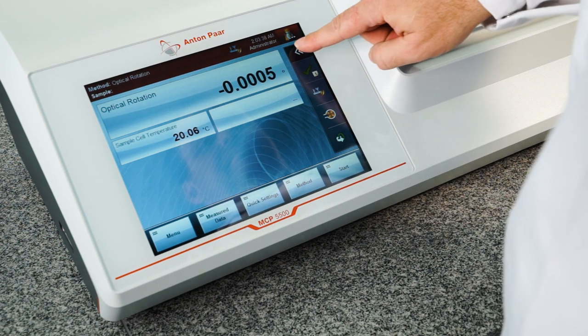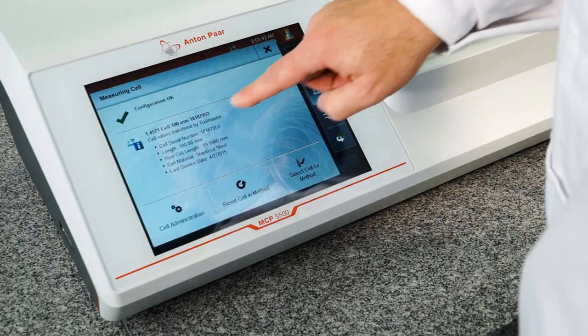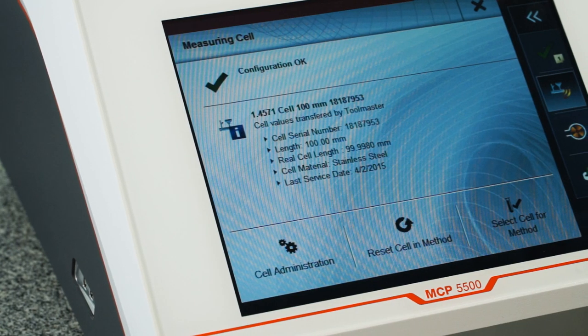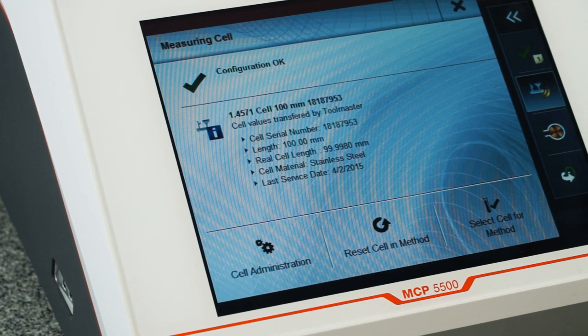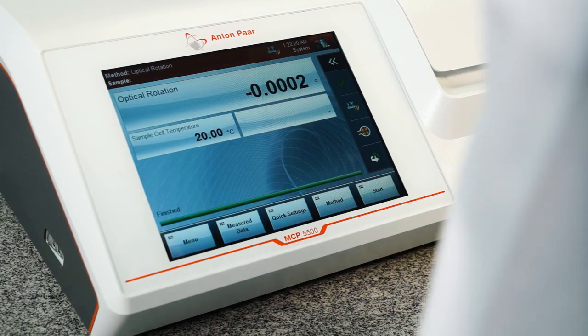The Toolmaster technology is also used for the Quartz standards. All relevant data concerning the optical rotation and the official reference values are stored on the RFID chip and transferred automatically to the instrument during the fully automated check or adjustment procedure. This helps you avoid errors caused by manual data input and leads to full traceability.